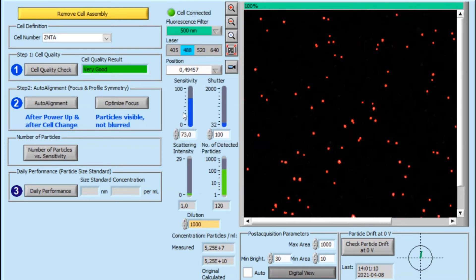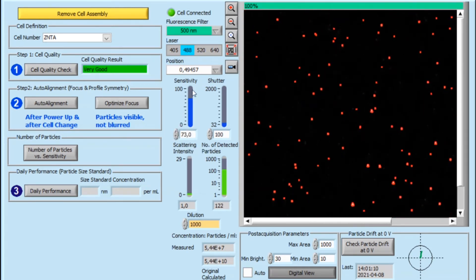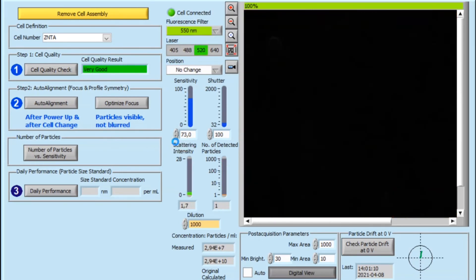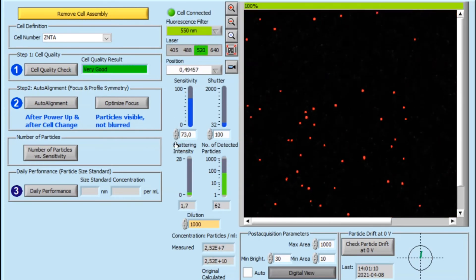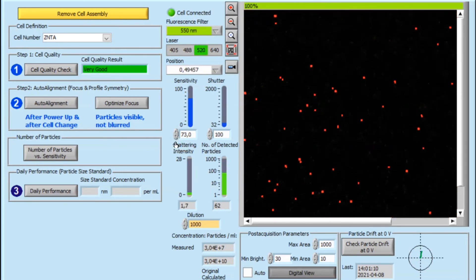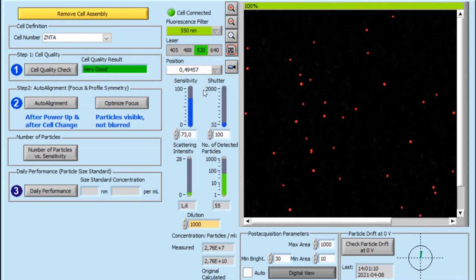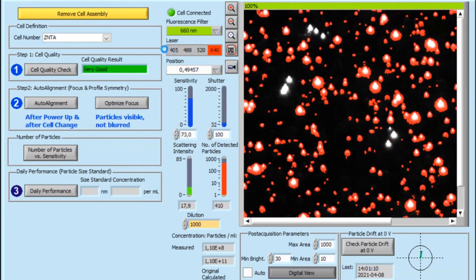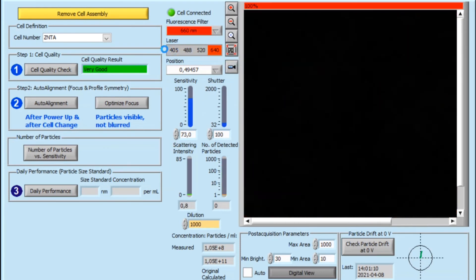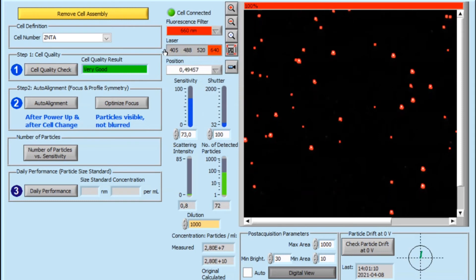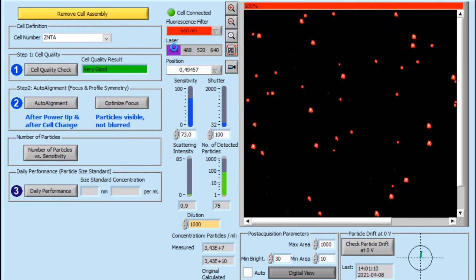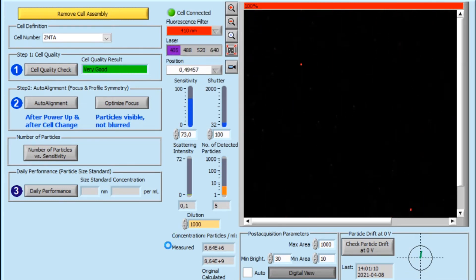By another click in the software, we can activate the green laser, showing us the CD63-positive fraction. With one more click, we can change to the red laser and the CD81-positive fraction. And last but not least, the violet laser with the CD9-positive fraction.